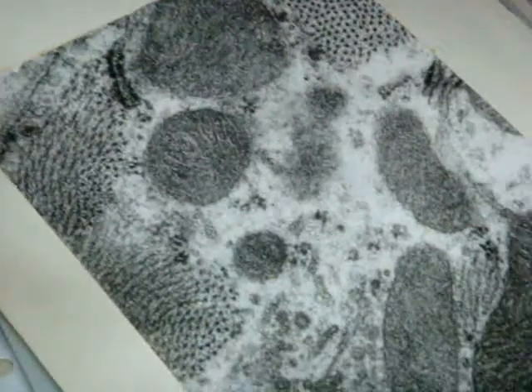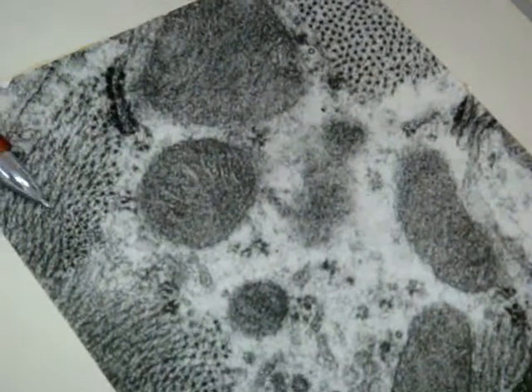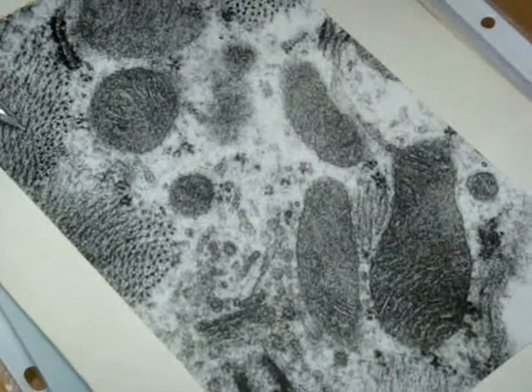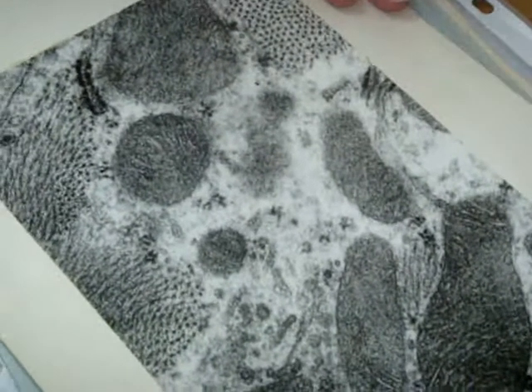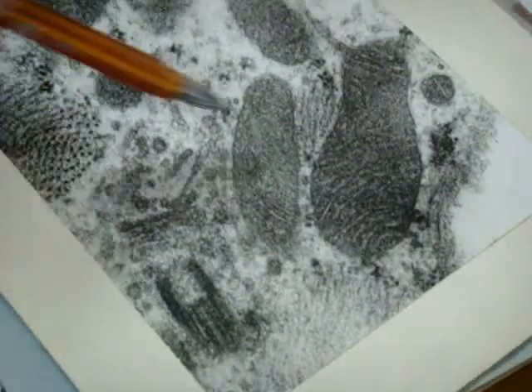What is it? Muscle cell. And look please, this is a cross section, this is oblique, so no very good arrangement. If you remember, among the cardiac cells, cardiomyocytes, we can find the conductive system. Conductive system cells actually arise from typical cardiomyocytes, but there we can find fewer myofibrils and they are not properly arranged. So these are cardiomyocytes that belong to the conductive system. Centriole, maybe Golgi apparatus, mitochondria.